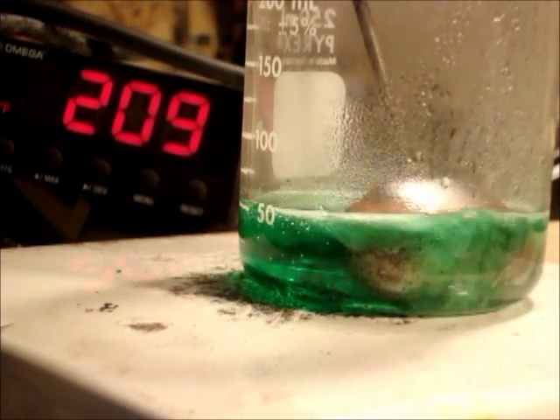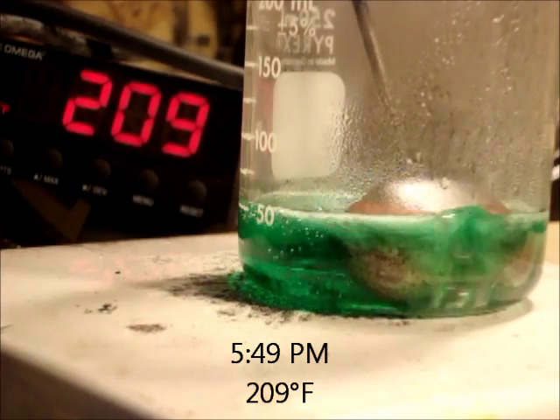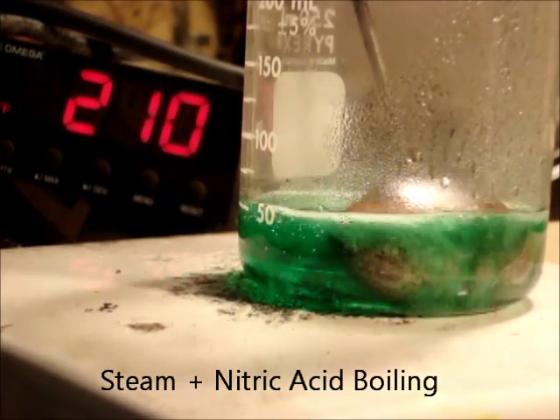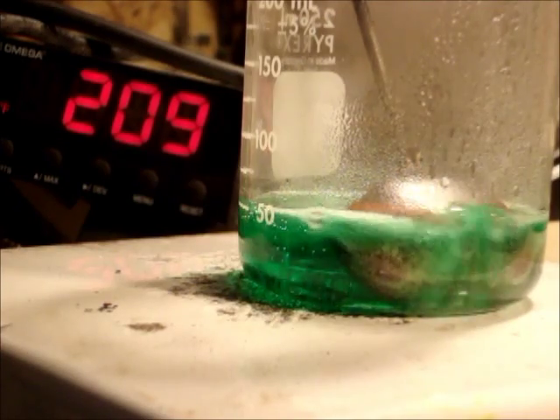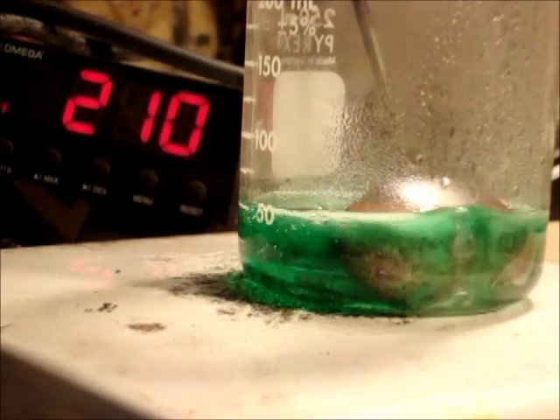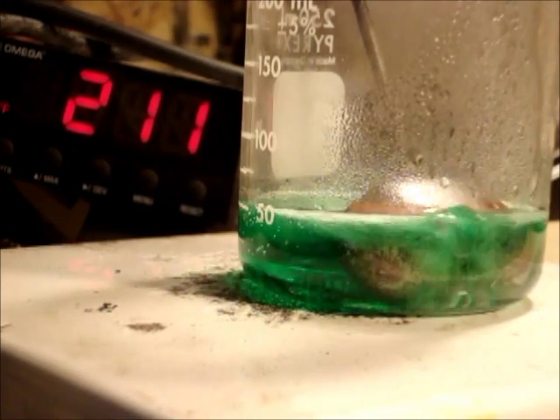Okay, it's a minute later. It's 5:49, and the temperature is 209, 210. It's bubbling real nicely. I think we've got nitric acid boiling now. I need to get the concentration of nitric acid from that 209 degree boiling point, and I'll have a little better results for you. But there's no NOx vapors yet. No brown fumes coming off.